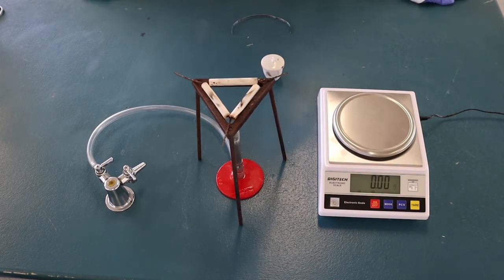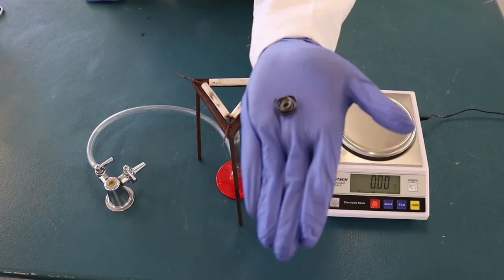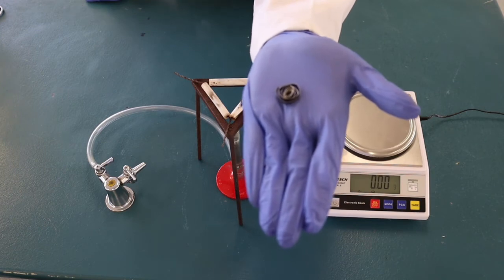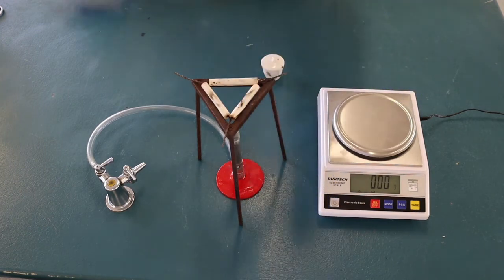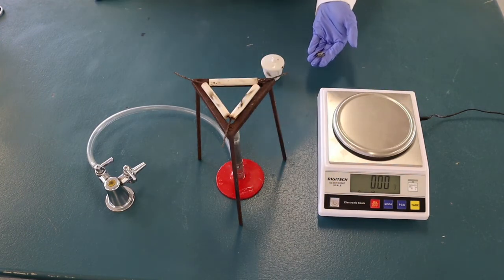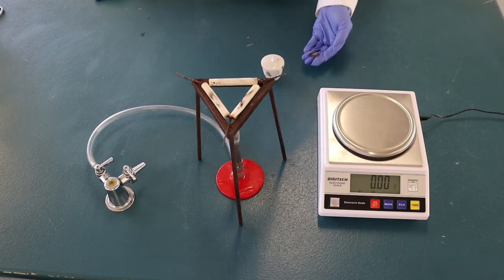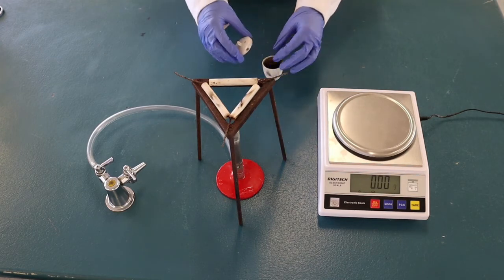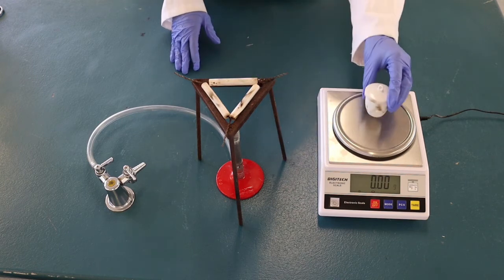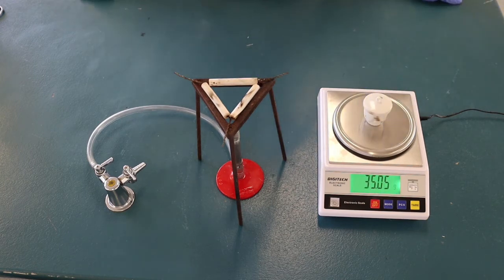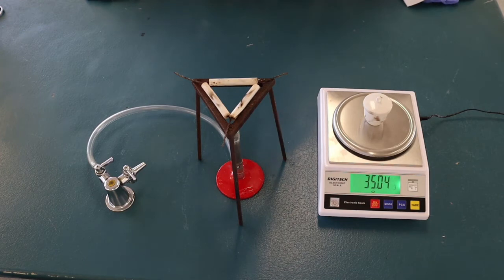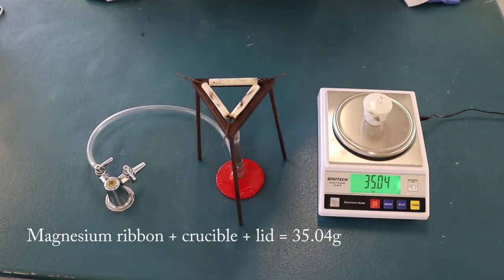Coil the piece of magnesium ribbon so that it fits inside the crucible. This is what the coiled magnesium ribbon looks like. Place the coiled magnesium ribbon into the crucible and weigh it on the electronic balance. Together, they weigh 35.04 grams.